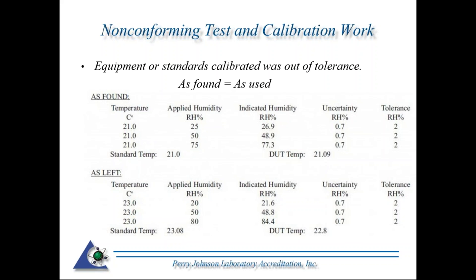Hence, if you send a device, and this is an example of what looks like a humidity indicator, just a body portion of a calibration certificate. So in this particular instance, if you were the testing or calibration lab, this would need to be inspected, i.e. for a couple reasons. One would be for traceability. So if this was needed for traceability purposes, of course, you're going to assure that those requirements were met.